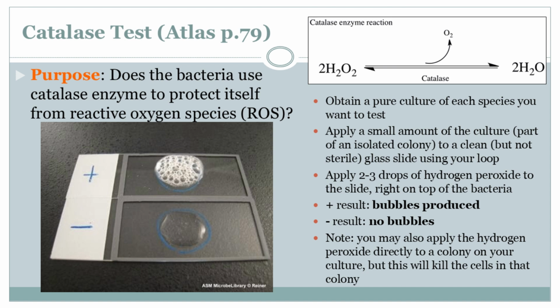Why is this enzyme such a big deal? It all has to do with how bacteria use oxygen. You know, like we breathe oxygen. Yeah, of course. Well, some bacteria use oxygen too. And when they do, they sometimes produce these byproducts, these waste products, called reactive oxygen species. We call them ROS for short. ROS sounds kind of dangerous. It can be. ROS can actually damage the bacteria. Oh, so it's like the bacteria's own metabolism is kind of toxic to them. Exactly. It's like cellular exhaust fumes.